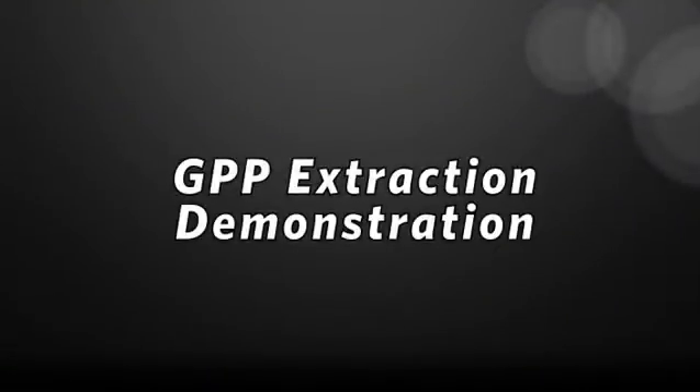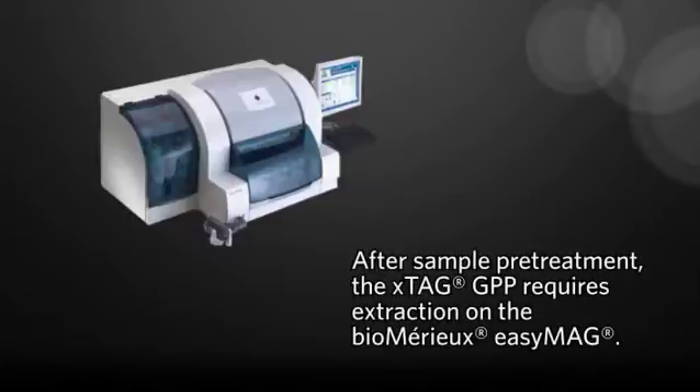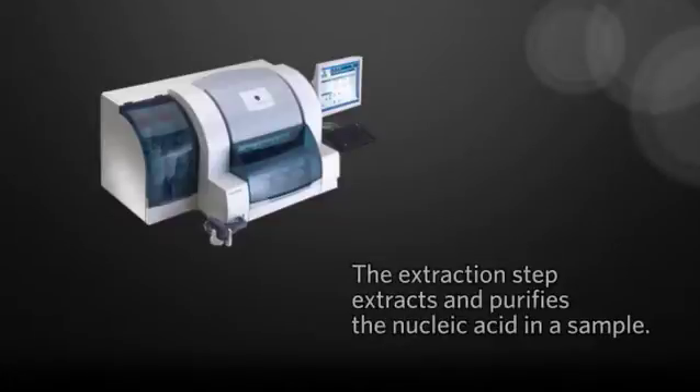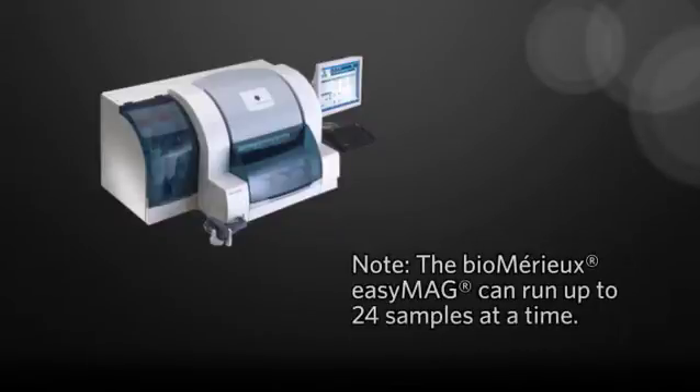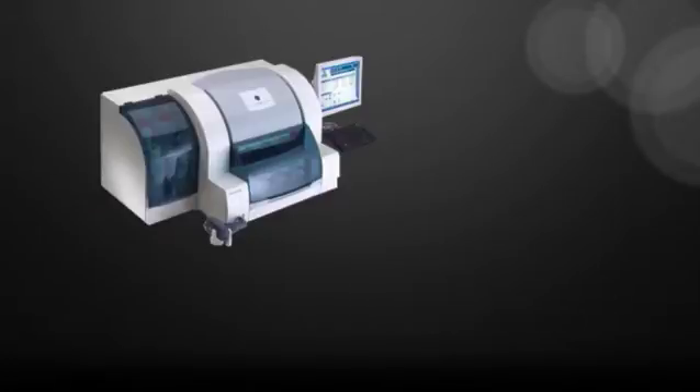Welcome to the GPP extraction demonstration. After sample pretreatment, the X-Tag gastrointestinal pathogen panel requires extraction on the bioMérieux easyMAG. The extraction step extracts and purifies the nucleic acid in a sample. This demonstration shows extraction steps on the bioMérieux easyMAG using Protocol Specific A 1.0.2. Note, the bioMérieux easyMAG can run up to 24 samples at a time.